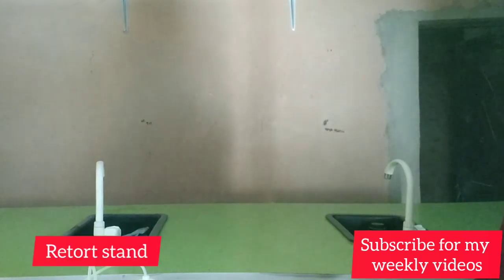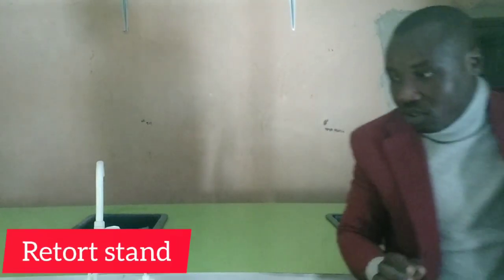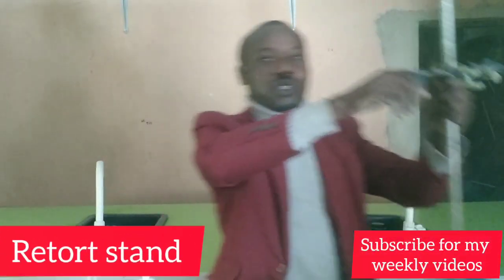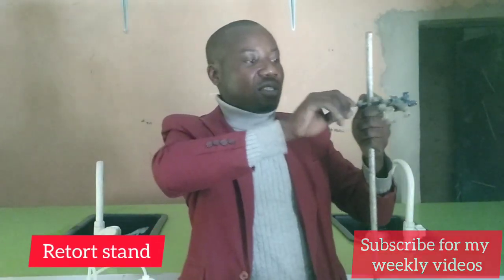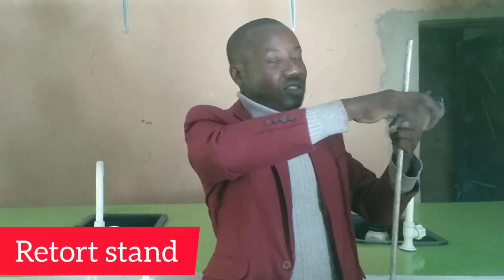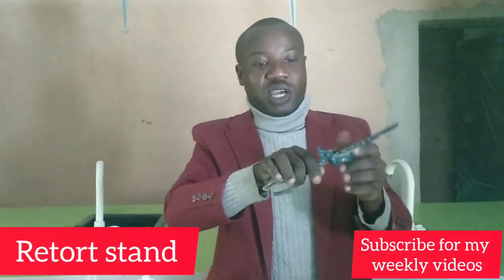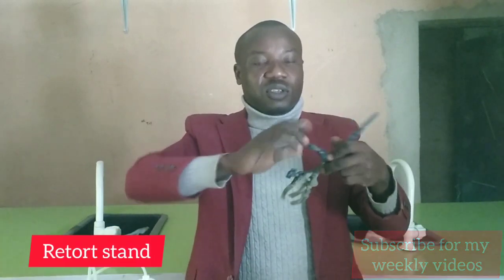So now we have the retort stand. This is a full retort stand, you can see. Now it has different parts. So I can loosen it and reset it. So it's something you can dismantle and something you can fix back. You can see it now. Even from here, I can also dismantle this. So this one now is the clamp. So you can now use the clip, everything to set it if you want to set.